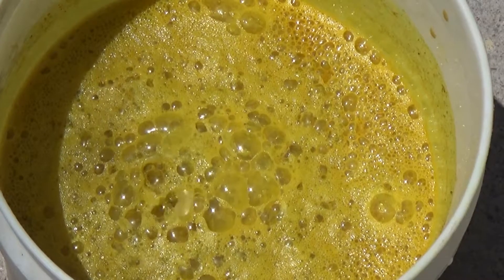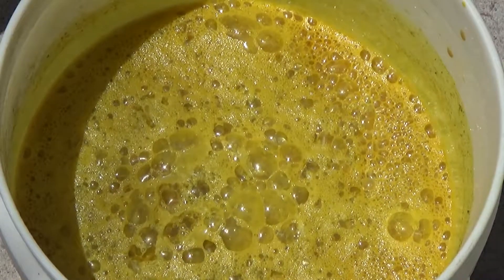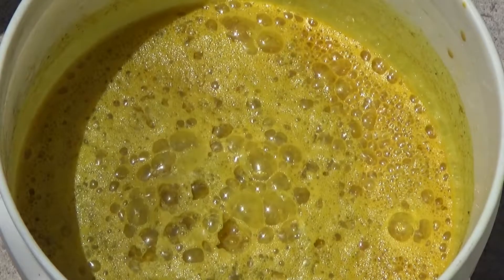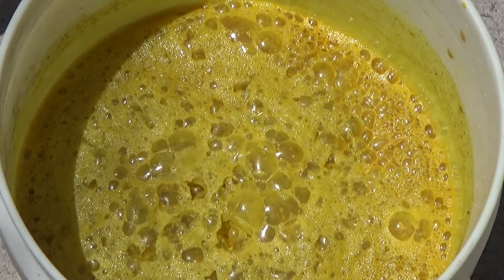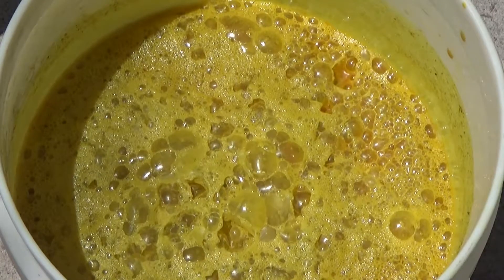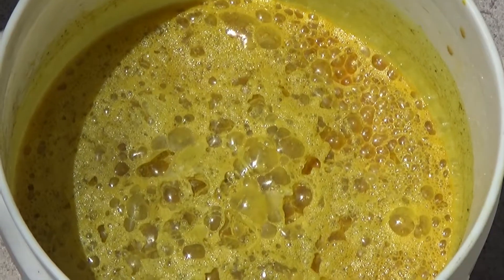We put the hydrochloric acid — the HCl — in it, and you can see it's turning into a nice golden colored chloride. As soon as this stops, we will drain it off and filter it so that we'll have a clear liquid. Then we'll actually drop the sponge, maybe later today or tomorrow.